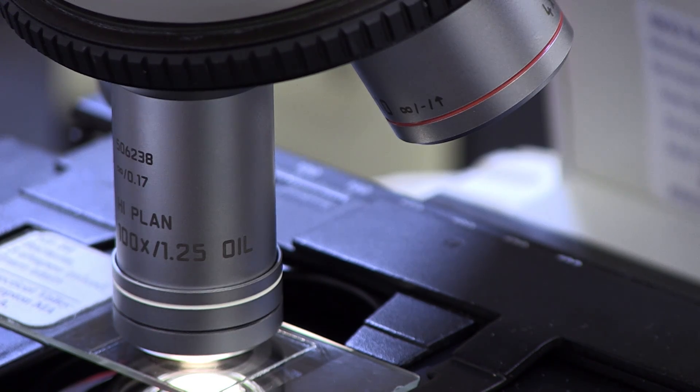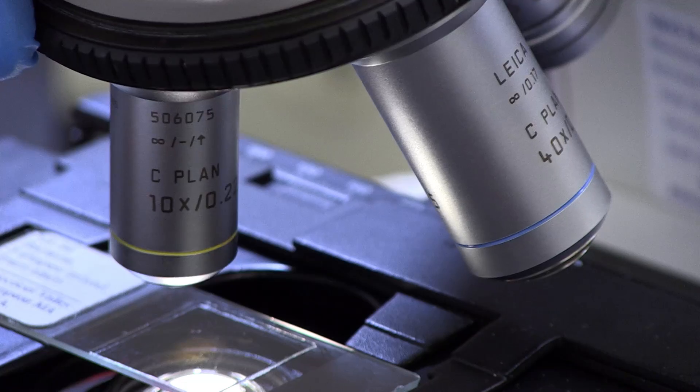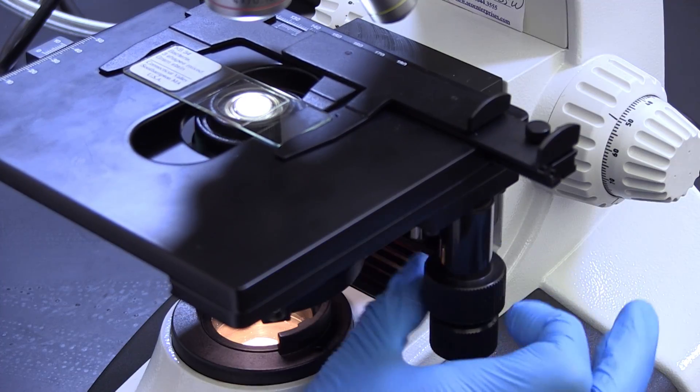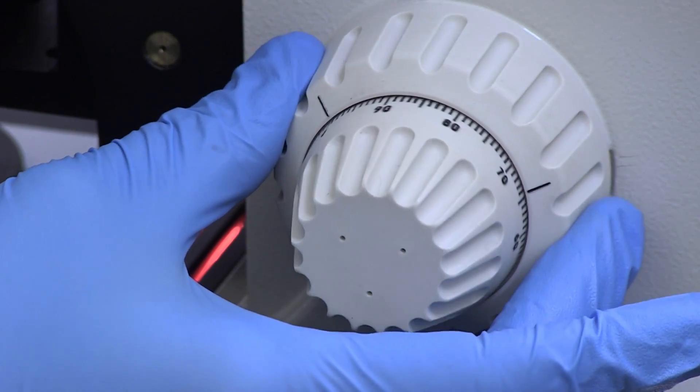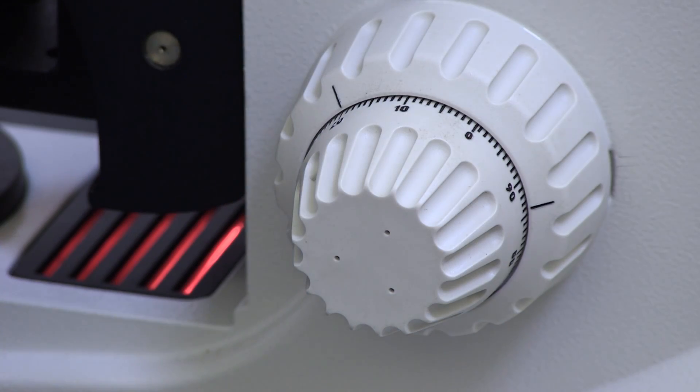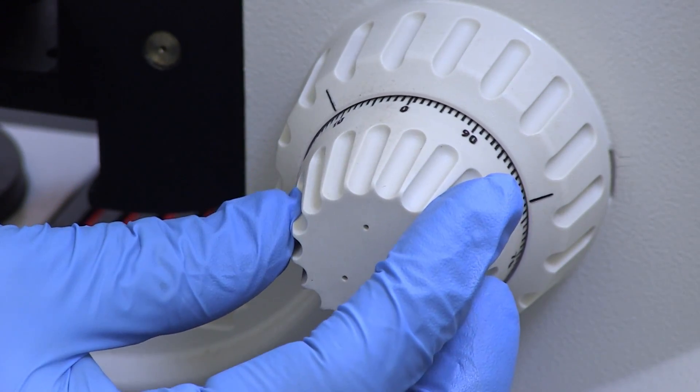Move the lowest power objective, usually 4x, into position, listening for an audible click as it slips into place. Scan the slide until you see the field of view. Bring the image into focus using first the coarse focusing knob and then the fine focusing knob to obtain the sharpest possible image.